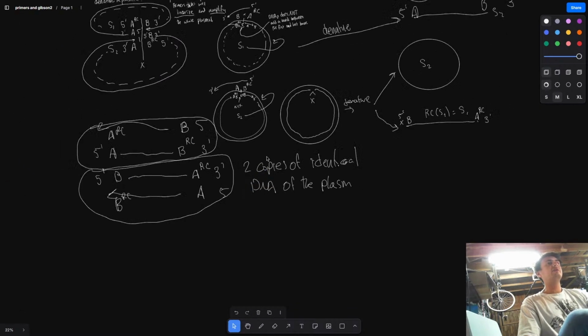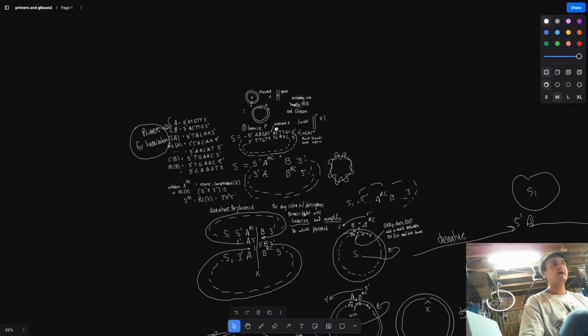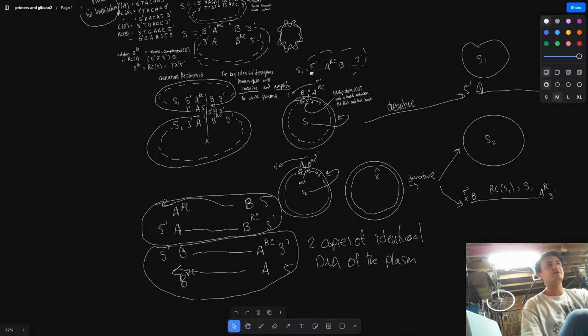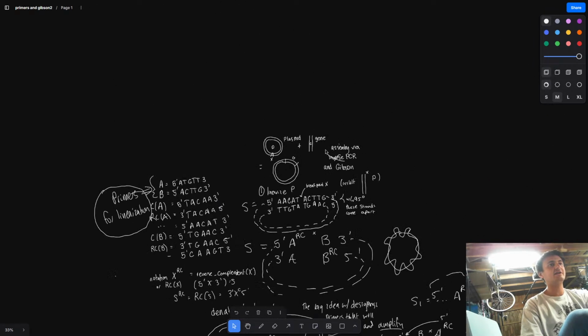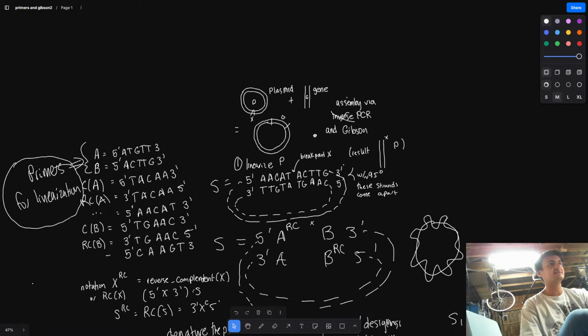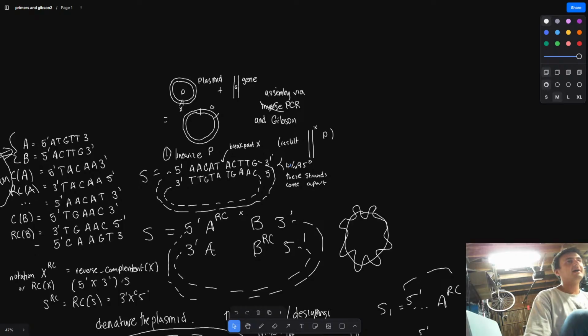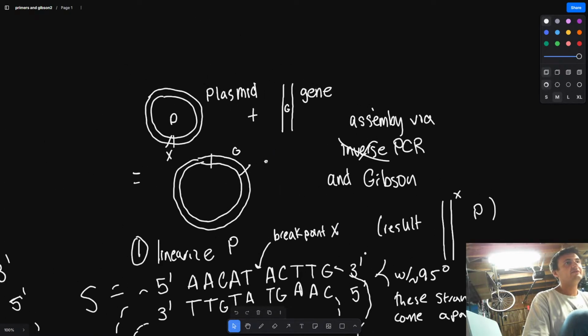Okay, so now we've done the first step of understanding how to, and wow, my drawings just get bigger and bigger. It's so funny. It always starts really nice and neat and small, and then it just devolves into disgustingness. But, okay, if we look at our tech tree here, step 1, linearize.